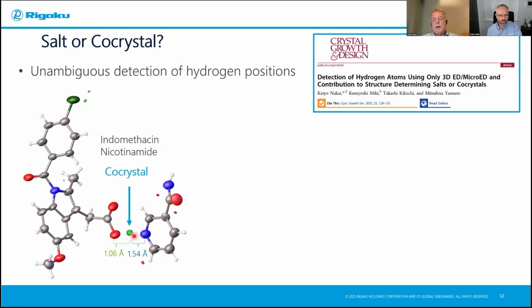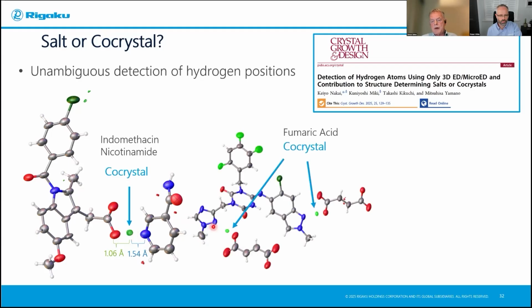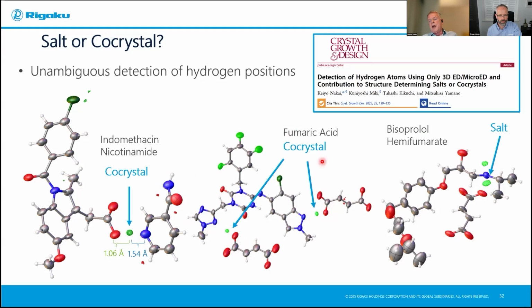This is the same molecular entity as indomethacin. It hasn't changed. In this particular co-crystal, again, the protons have not been transferred, so these are the same molecular entities. And in the final example here, the proton has been exchanged. Now we have a salt formed, and so the molecular entity of the API, the active, is actually changed at this point. So because of the way the agency characterizes and deals with salts and co-crystals, you really have to know what it is you're dealing with when you have co-formers in the crystal.